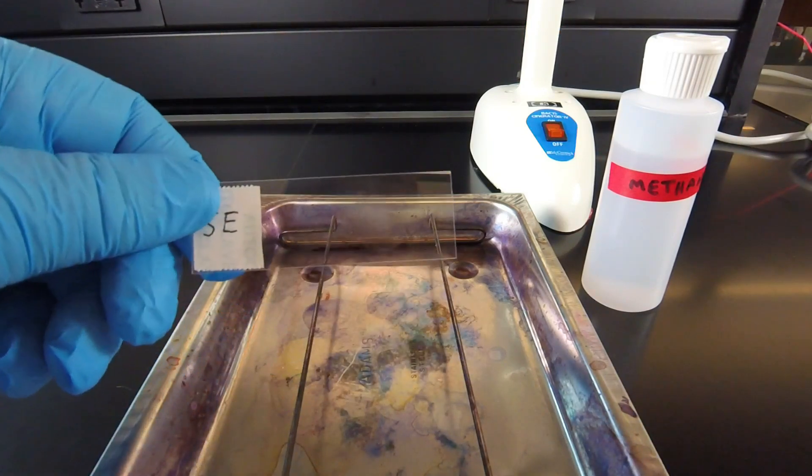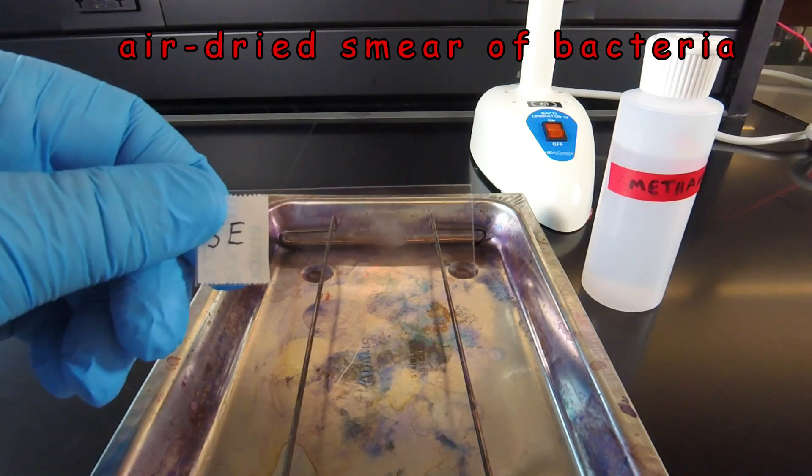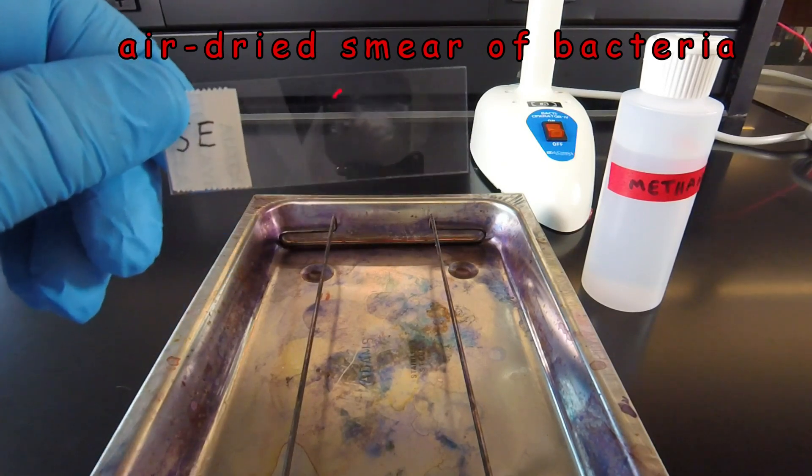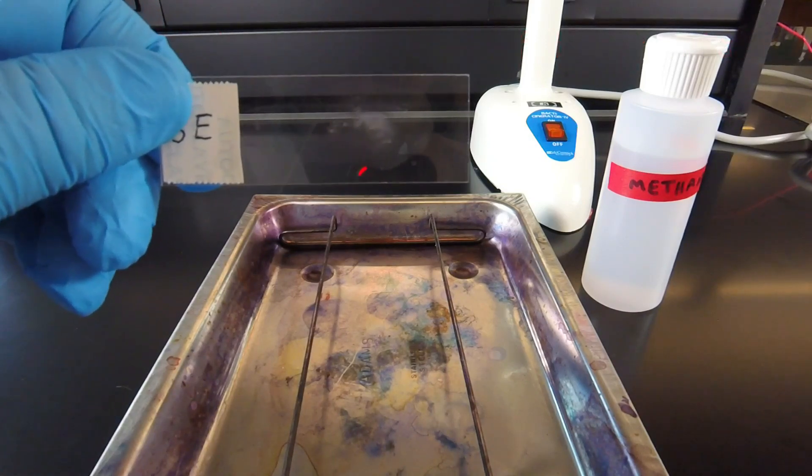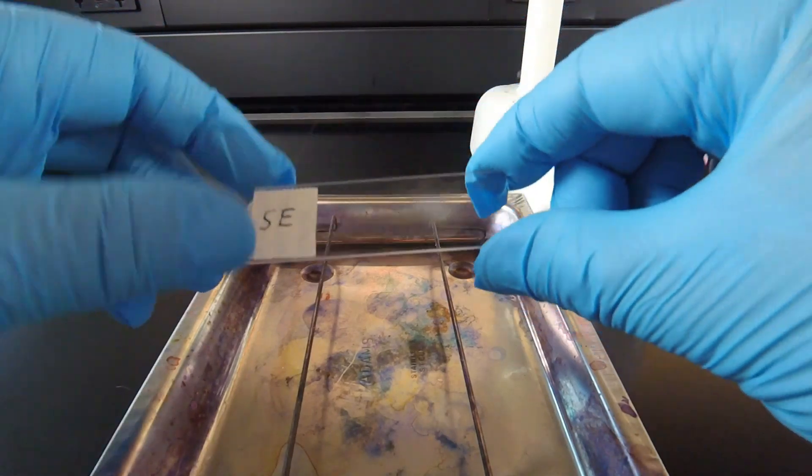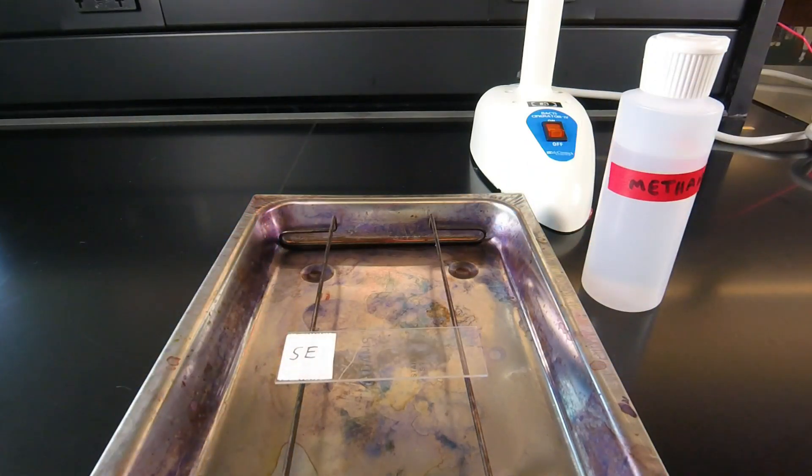We have a slide that we've prepared. This is an air-dried smear of the bacteria coming off of an agar culture, and we learned how to do this preparation in a previous video lesson. So we place our microscope slide with the air-dried smear on our staining tray.